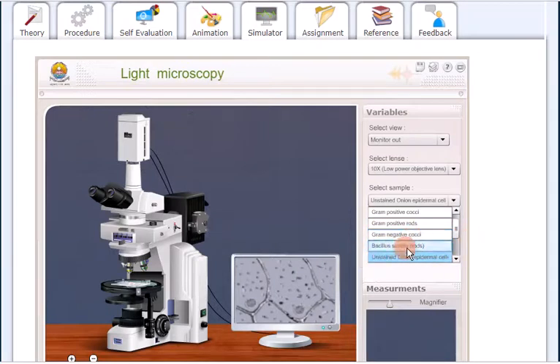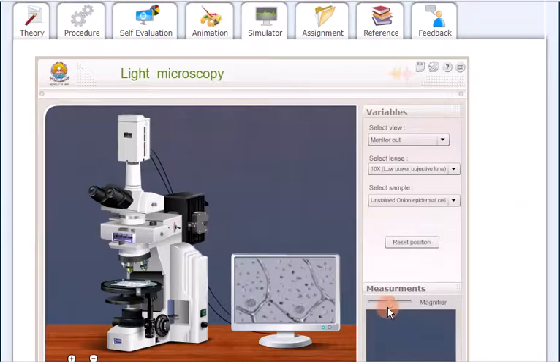And there is also bacillus. Yeah, you can see this bacillus bacteria, and there is a gram negative and gram positive. All right, then there is another space to increase the magnification measurements. You will see later on how you want to increase the magnified areas, maybe which area you would like to see. So this is what you will have to do, magnifying again the measurement of each specimen. All right, let's go for that.